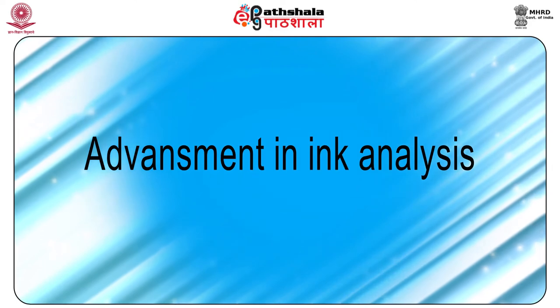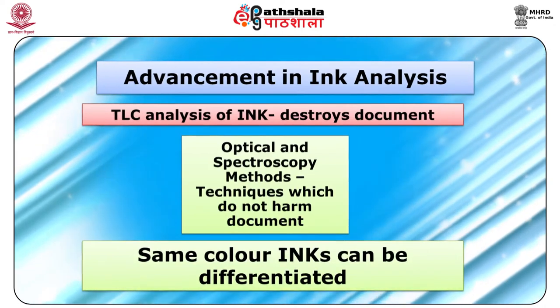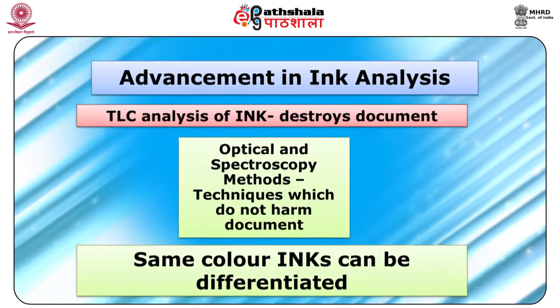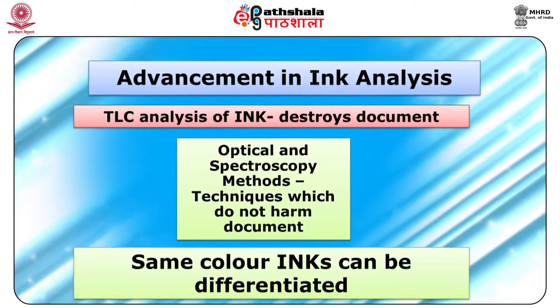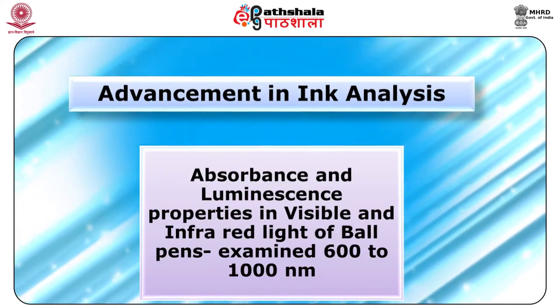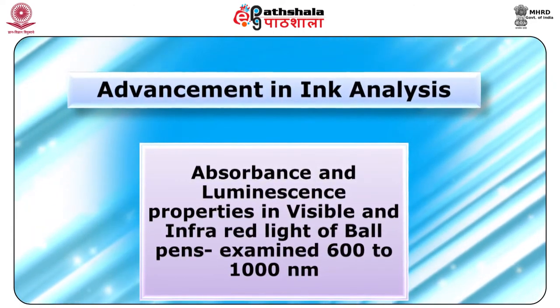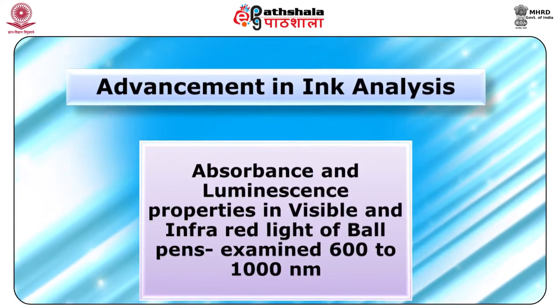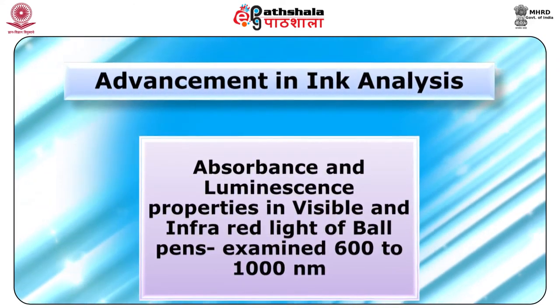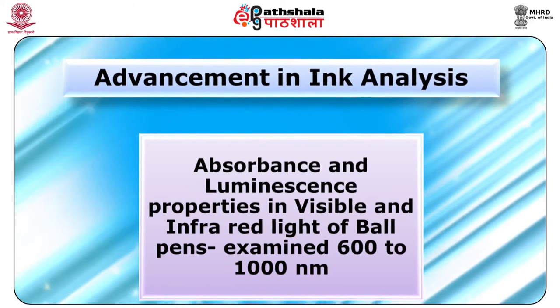Now let us see the advancement in ink analysis. The most commonly applied optical and spectrometry methods are finished with destructive examination by means of thin layer chromatography. The absorption and luminescence properties in visible and infrared light of ballpoint pens can be examined with a system of filters letting through light of a specified wavelength from 600 nanometers to 1000 nanometers.